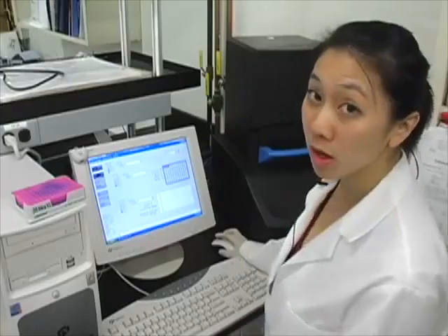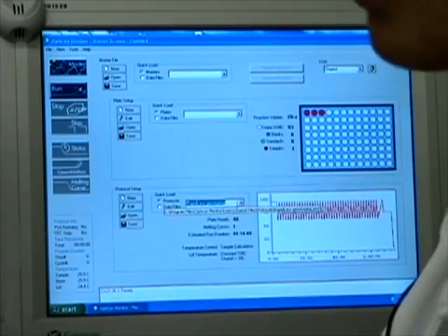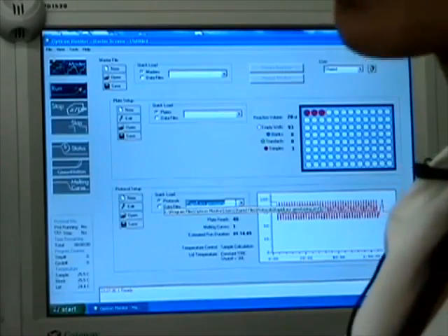Next, I'm going to load a protocol that we've designed for Sigma's rapid genotyping. This protocol involves a 3-minute denaturing step, then a cycle of 15 seconds of denaturing, 15 seconds of primer annealing, and then 20 seconds of primer extension. Now, the primer extension time can actually be dropped down to about 10 seconds, and thus you'll have a total of only 40 seconds for each cycle. We have those 3 steps cycling about 40 times like in a normal PCR, and then at the end of that we take a melting curve.